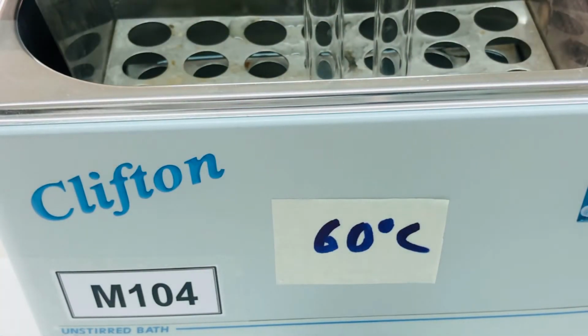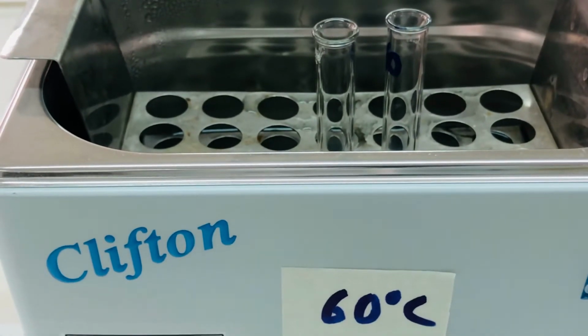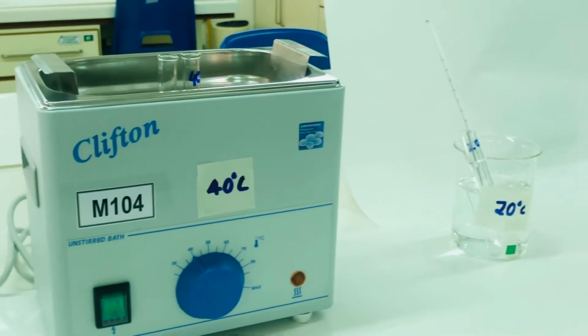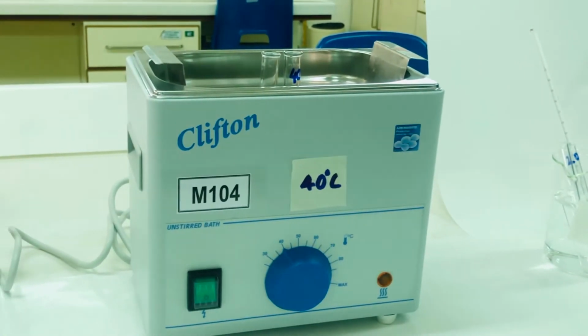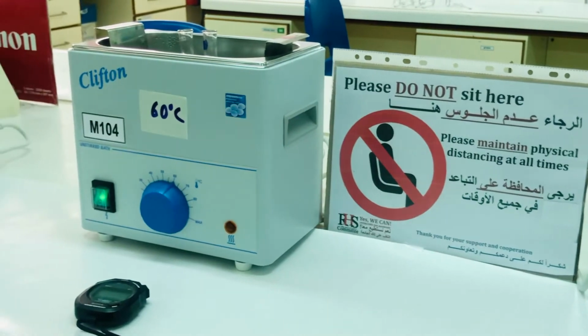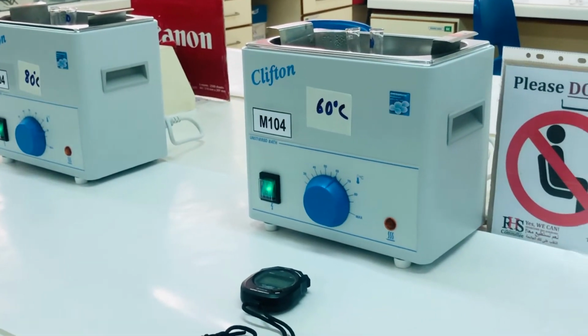This is in order to attain the temperature of the water bath. As you can see, the test tubes have been placed in various water baths to attain the temperature of the water bath.